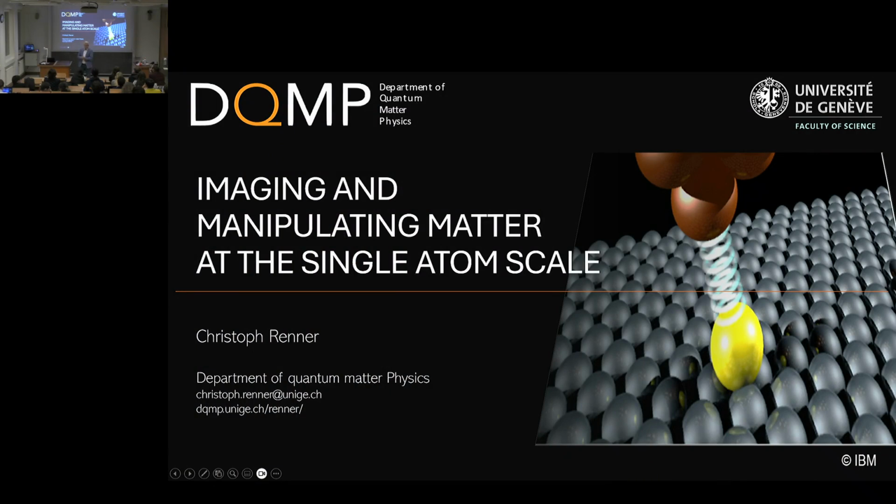And what I want to do today is give you really an overview of some of the possibilities that STM, scanning tunneling microscopy, can do. Go beyond a bit what Eliot explained. He focused mostly on imaging, but I will show you that there can be much more than imaging.